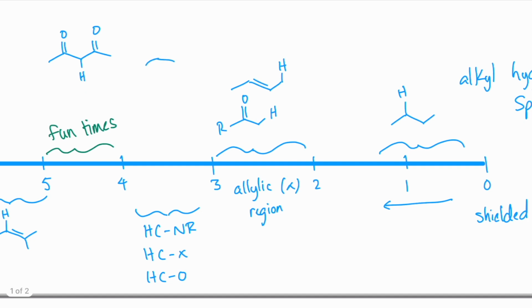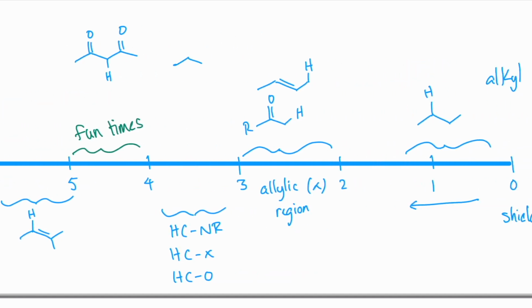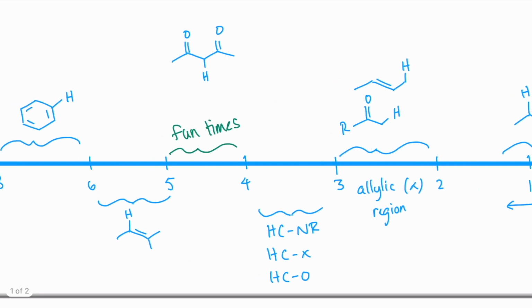Same thing for, let's see, what's a good one? That would be another one. So all these different variations are important to take into account, where if you have something that's way higher than it should be, but you're sure it has to be this hydrogen, this splitting pattern, perhaps there's something else nearby that's forcing it a little bit higher.